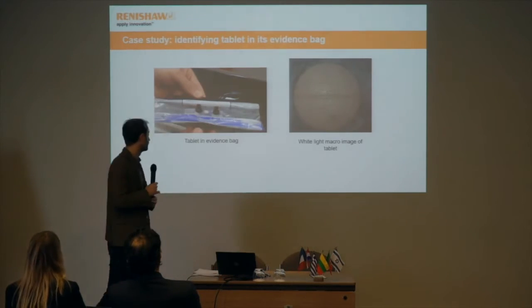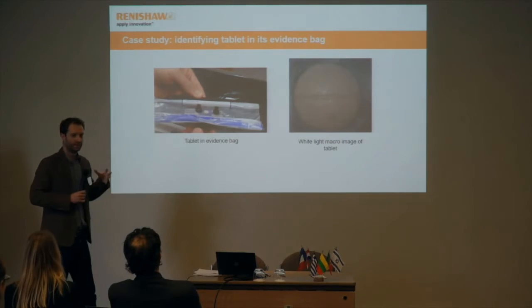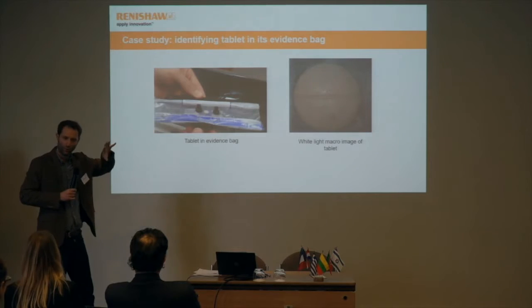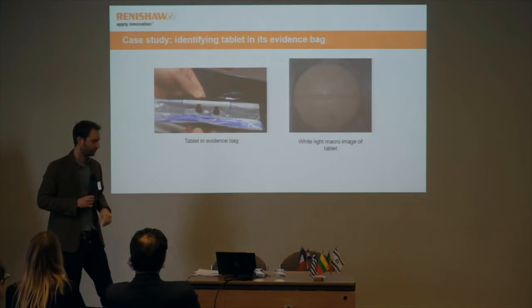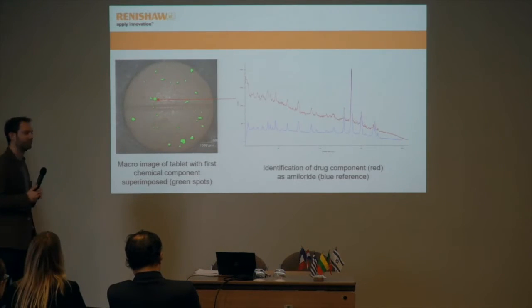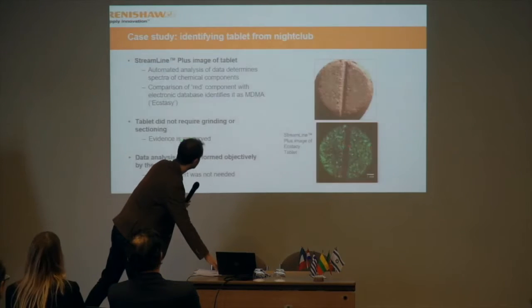So, drugs also. Here there was an interesting case where we measured a tablet which was still inside the evidence bag. Because the Raman microscope is intrinsically confocal, we can detect the Raman signal from the tablet with very limited contribution from the polymer of the evidence bag, which is obviously quite interesting for forensic labs. So we could identify the substance of interest on the tablet in a fairly straightforward way. So that's quite a useful tool for that.